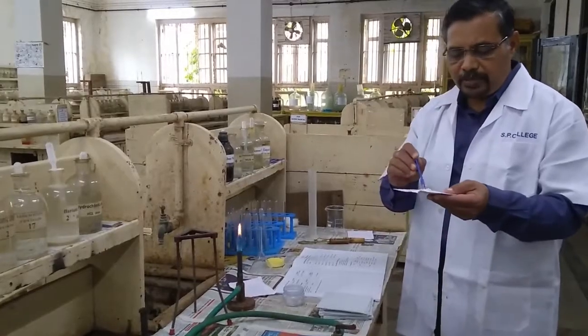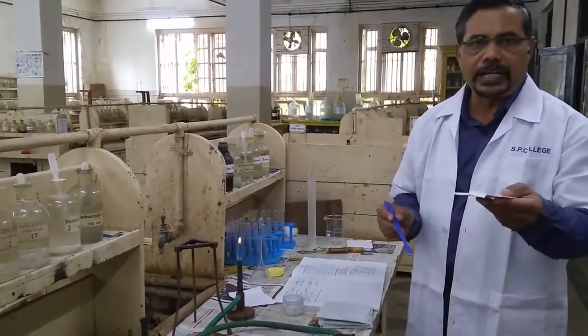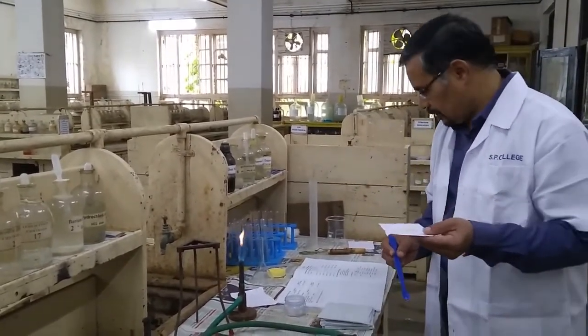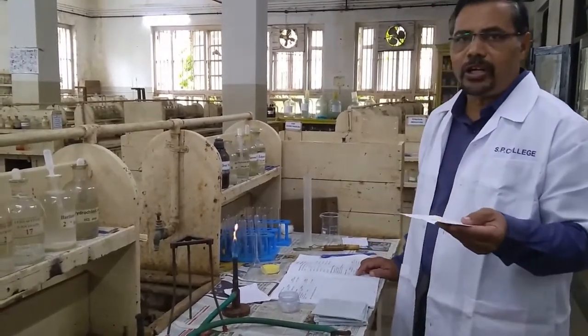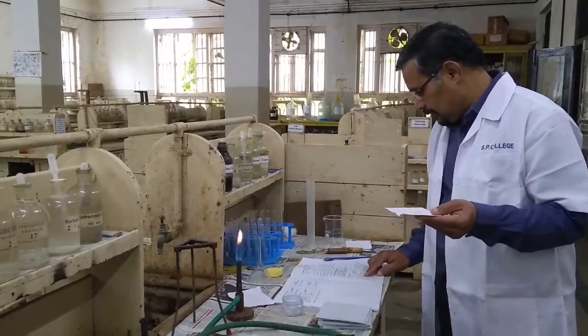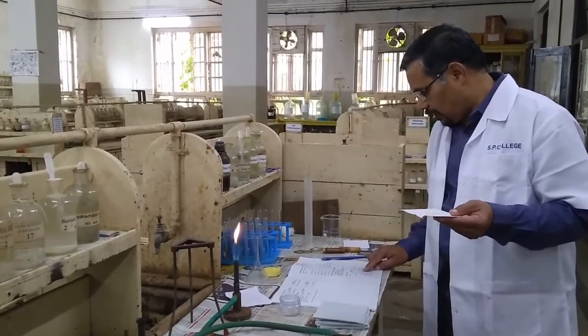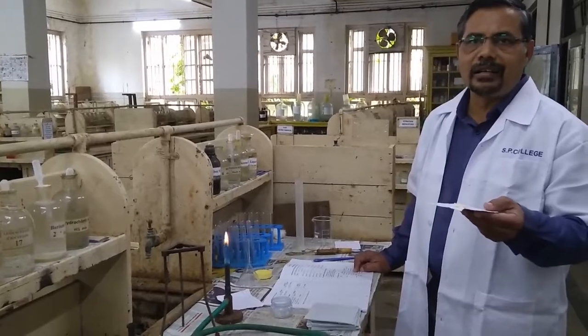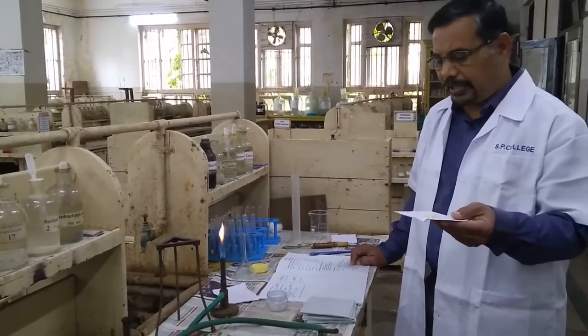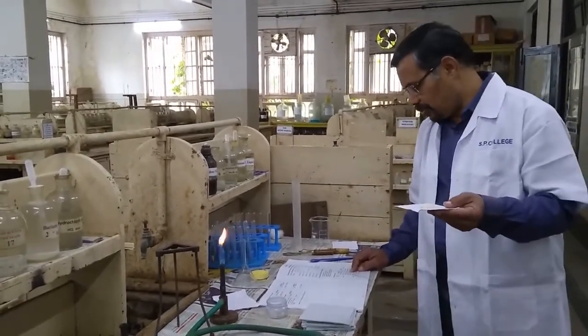So color of this mixture is white or colorless. So the inference is that colored radicals are absent, means colorless radicals are present in the given mixture.